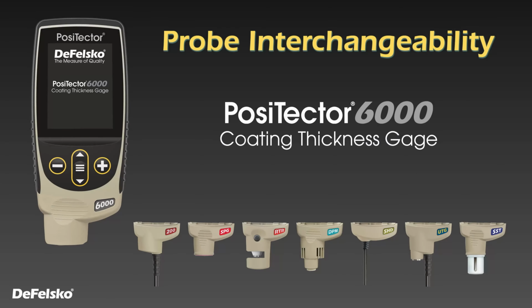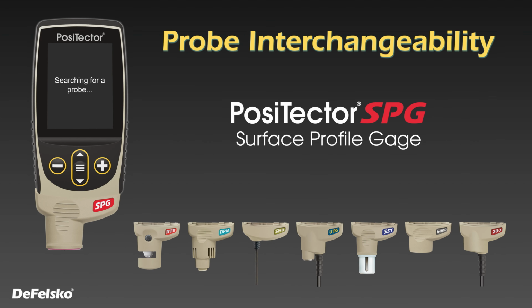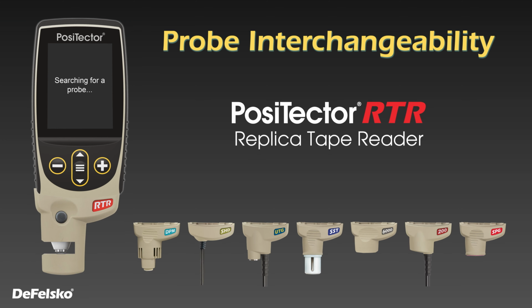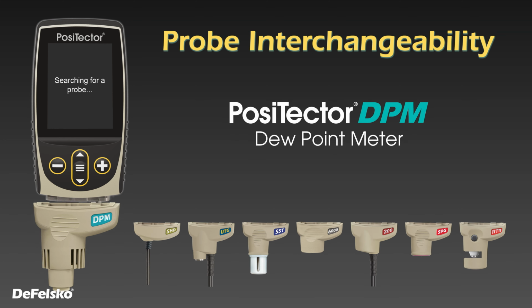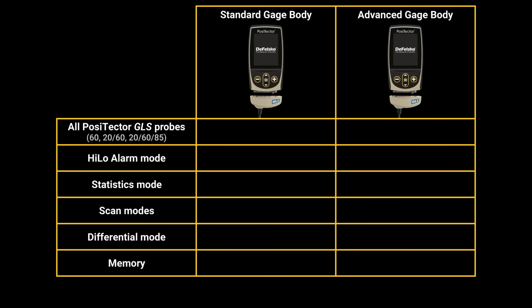The PosiTector gauge body is also compatible with any PosiTector probe, quickly converting from a gloss meter to a coating thickness gauge, surface profile gauge, environmental meter, and more. 2 gauge bodies are available. The standard gauge body is compatible with all PosiTector GLS probes, has a high-low alarm mode, and can display on-screen statistics such as the average, standard deviation, min-max, and number of readings while measuring, storing up to 1,000 readings.